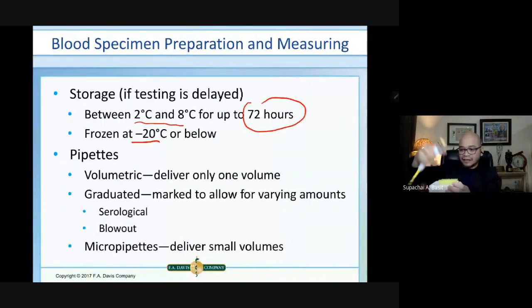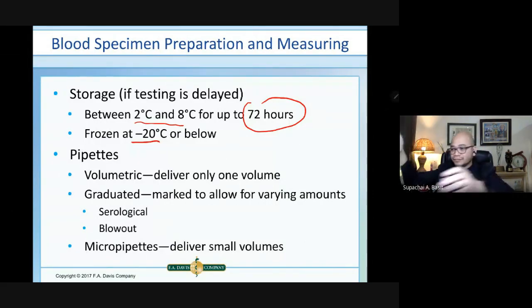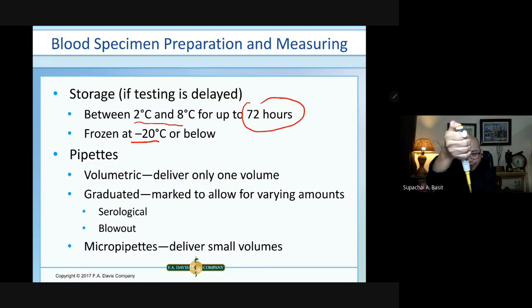Sorry. So you get the pipette tip here, and then you can get materials, the liquid. So you just have the first push. And then if you're going to transfer it to another container, then you can push it up to the second push. So what's the purpose of the first push?